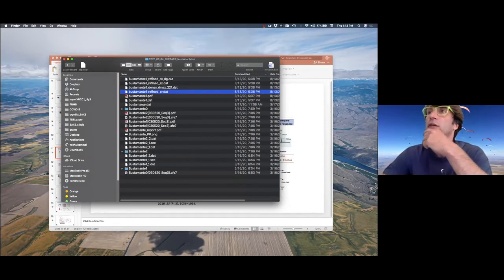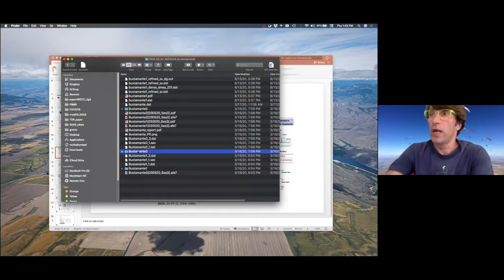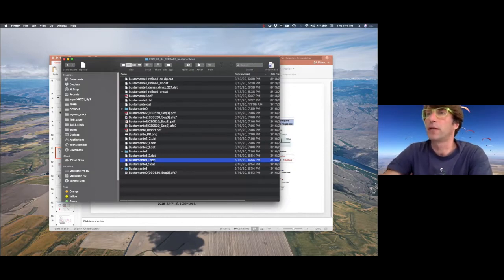What you see there are subdirectories. 0 is the name of the lab, and 0 means that's the BSA. For each user, we collect the BSA. Then we have sample 1 and sample 2. I think that's clear. In this case, you can see these are SEC files. They can be directly uploaded to Scatter 4.